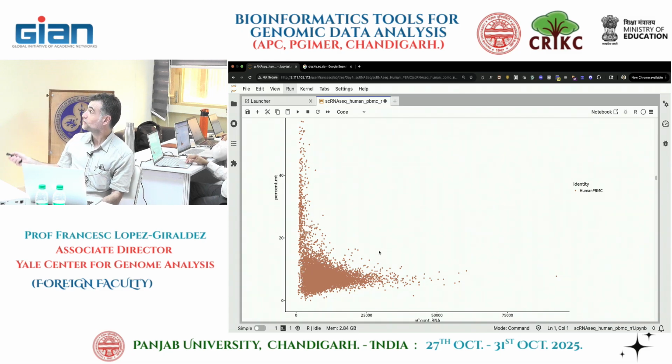Well, no, you would see a line. What you're saying is you would see some line growing here. All of these cells with mitochondrial expression have very low count RNAs. So they are not expressing other genes much either, right? This is the healthy population, right?